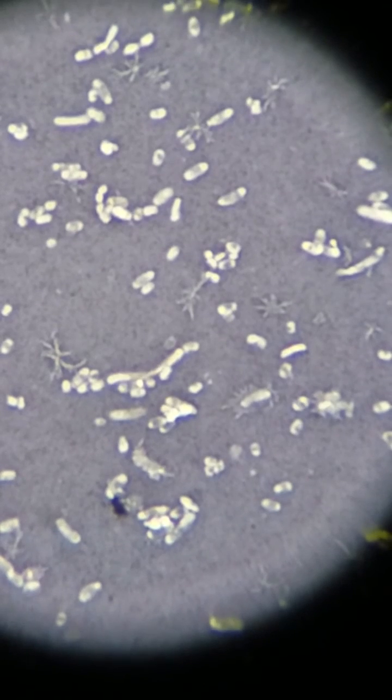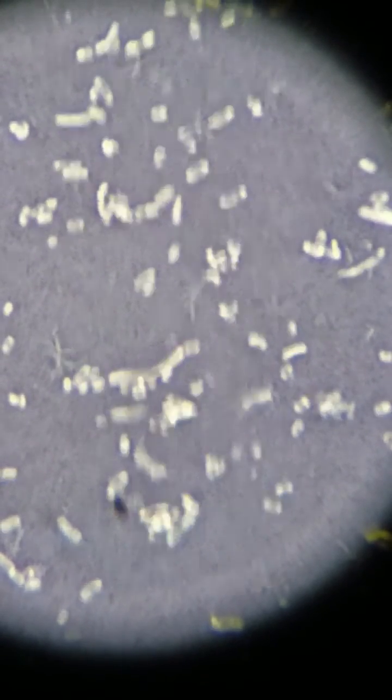It could be volutin, it could be DNA, it could be a bunch of different things you don't know because it's still too small, but what this does show you is the application of a negative stain. Okay? Thank you.